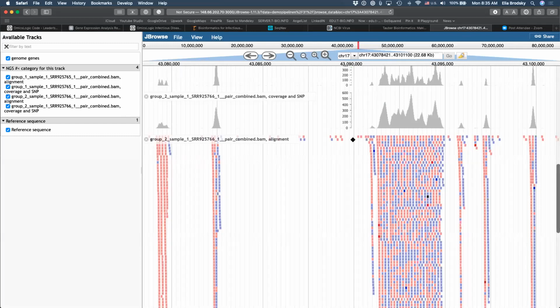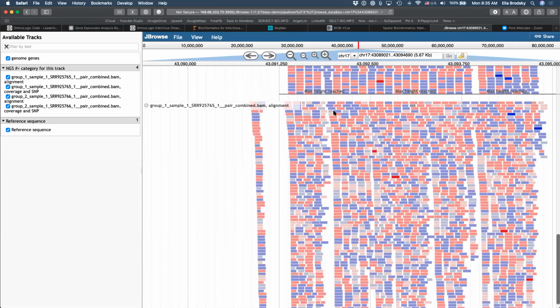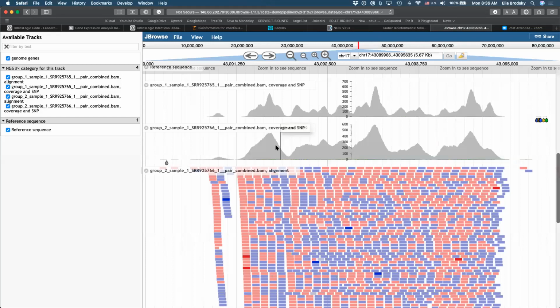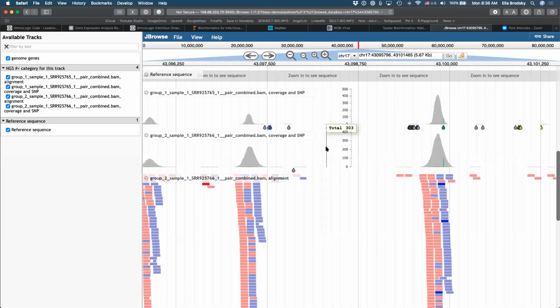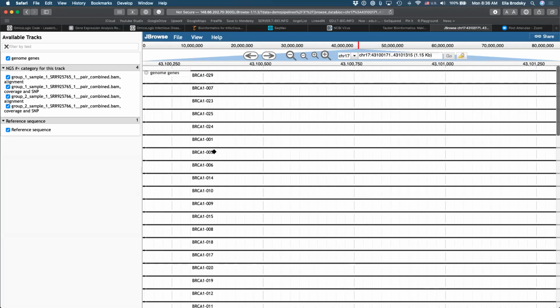As you can see, each sample represents millions and millions of reads. These are individual reads that we can look into that have a sequence with A, T, C, and G. Those sequences are mapped onto a reference genome. In this case, this is the human genome with variable coverage, allowing us to find variation or changes that are significant from the reference genome. For example, here we can see this green little marker, and this marker represents a SNP or a variant that we can study.